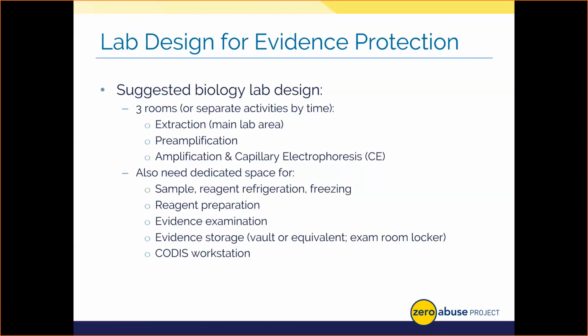And according to SWGDAM, examinations, DNA extractions, and PCR should be separated by doing these activities in separate areas, in separate spaces, or at separate times. So we focused on separate times in our lab. We just wouldn't overlap with each other, and we shared the space. What that meant was it took a little bit longer to get your results, but that still kept us in compliance and ensured that we were minimizing and mitigating any potential contamination.